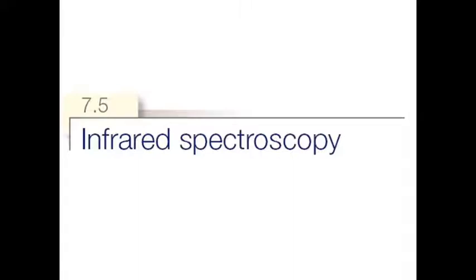Well, we're going to have a look at the next of our spectroscopic techniques, and this one's called infrared spectroscopy. It's quite different from the other four that we've looked at so far, because the energy that we are using for IR is of a lower energy level than the ones we used for the previous techniques. So let's just do a bit of a recap on what we've discovered so far.